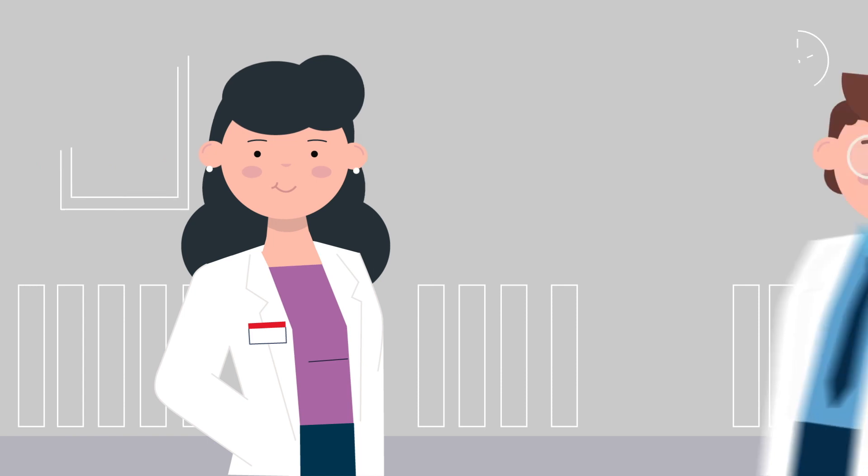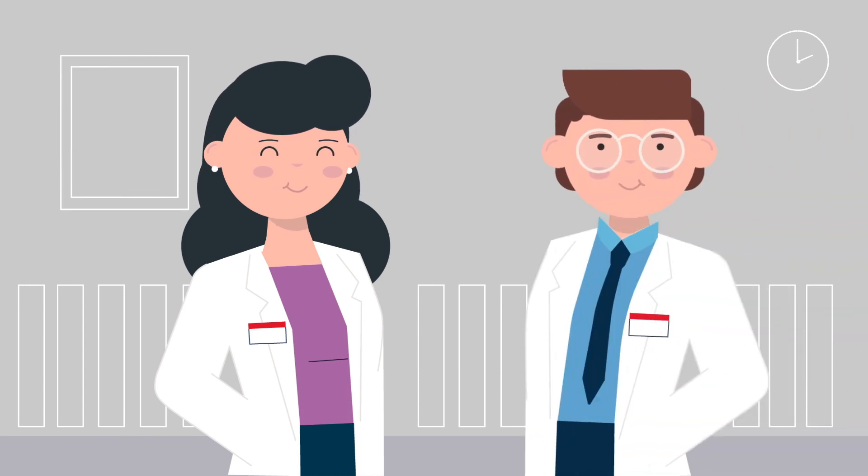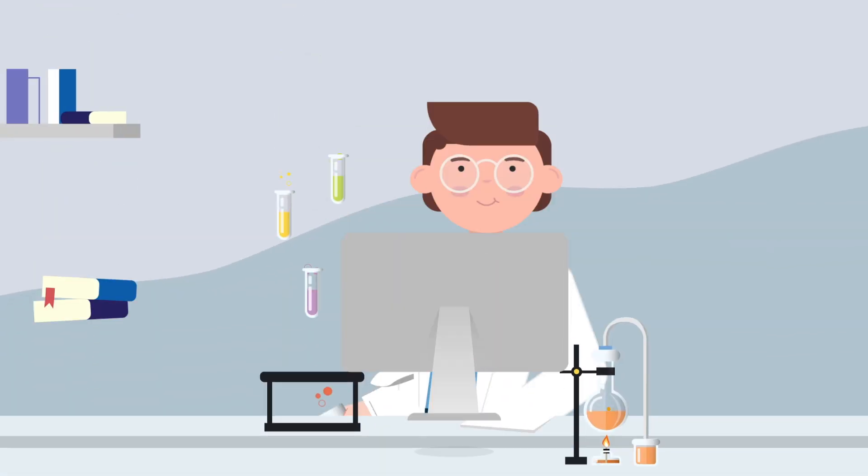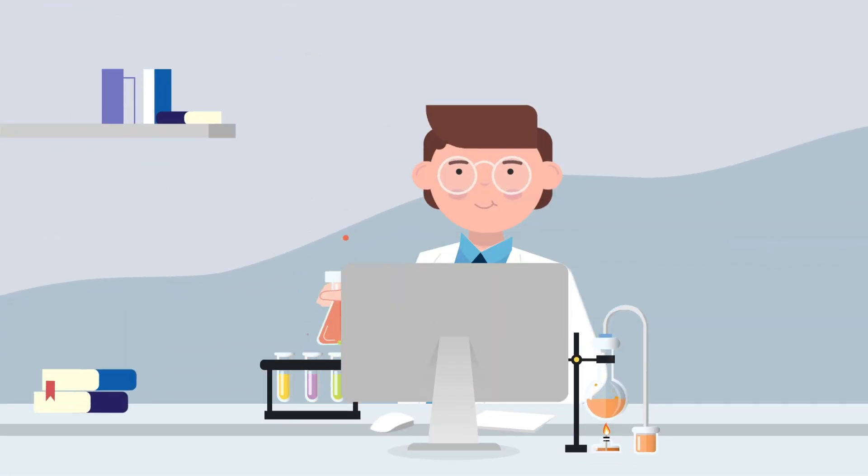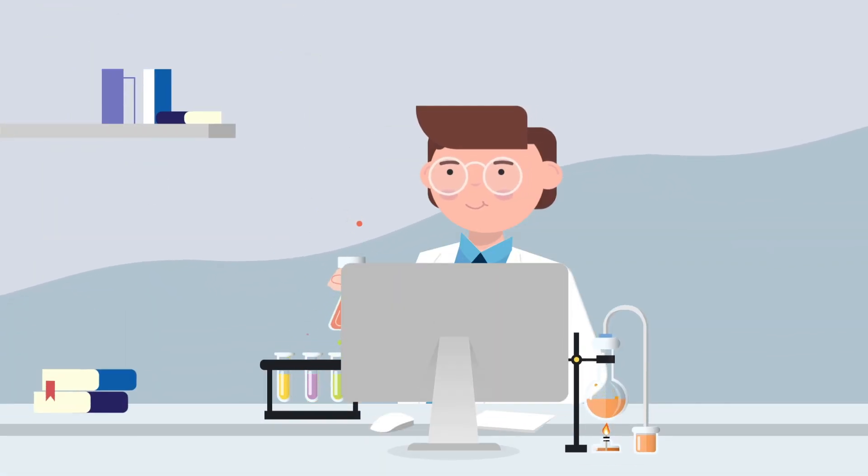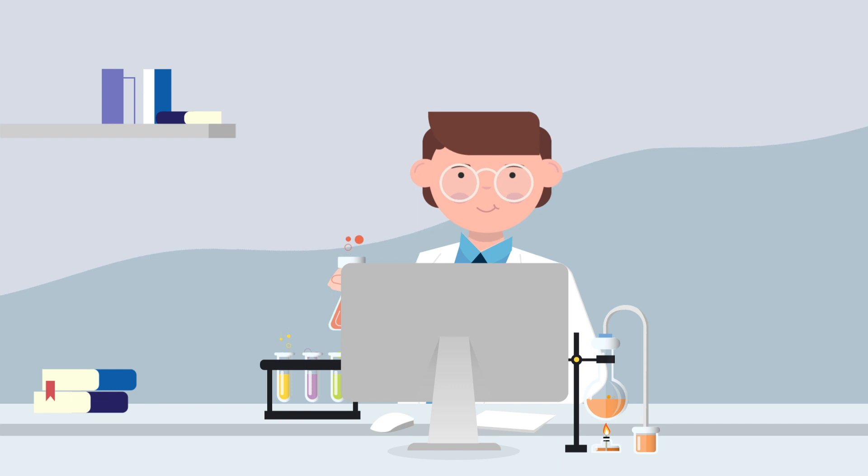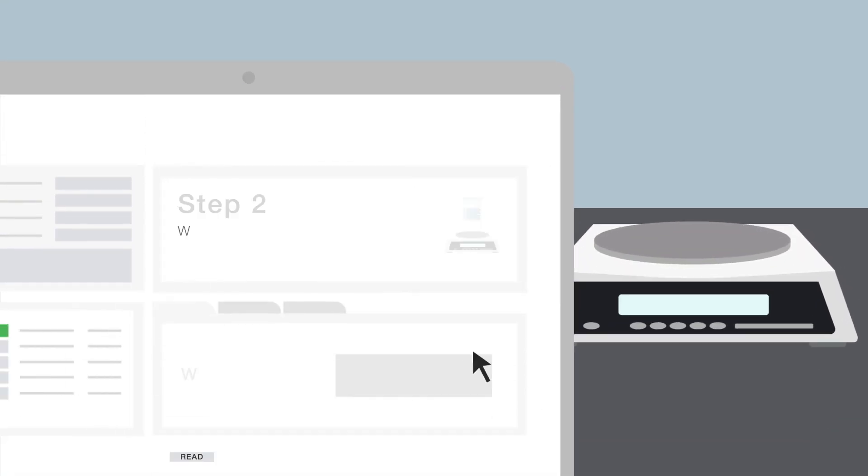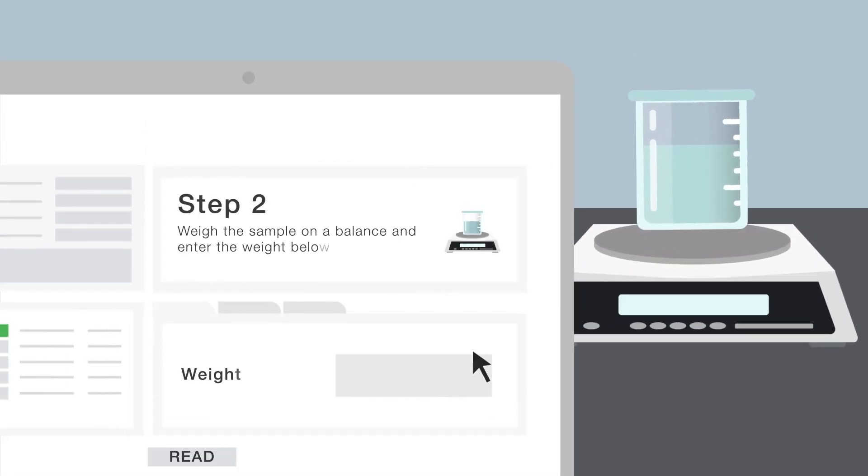So, in a lab using Sample Manager's lab execution system, when the lab manager assigns a procedure to the technician, the technician starts a task in Sample Manager. They are taken through the procedure step by step and data is recorded in the LIMS as it happens.